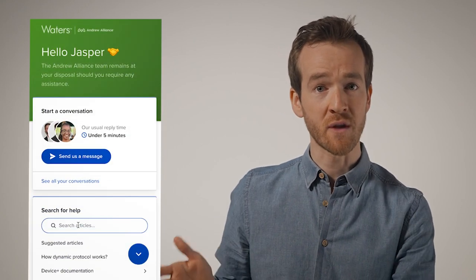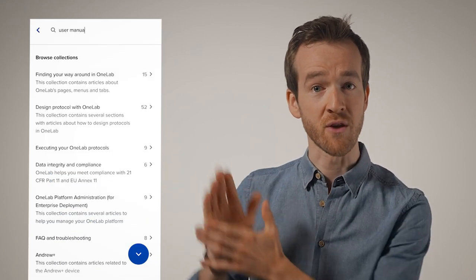Let me walk you through creating a method that includes an Extraction Plus device. But first, let's get you connected by pairing the device to your workspace. The device pairing process can be done either through Wi-Fi or directly via LAN in a few quick steps. Just follow the software prompts and our quick start guides in the user manuals that you can find right here. Extraction Plus is a bit unique as we're actually connecting the software-controlled pump part of the device to OneLab.